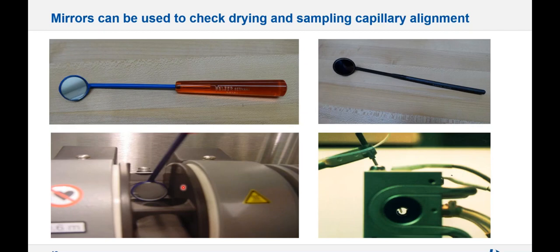And if you see vapor in the second dry step, you want to make sure the step is 15 seconds beyond the point where you don't see any more vapor. Very important that you dry your sample completely without any kind of splattering. And ideally, you don't want to see large droplets on the mirror either. That could indicate that it's drying too fast.